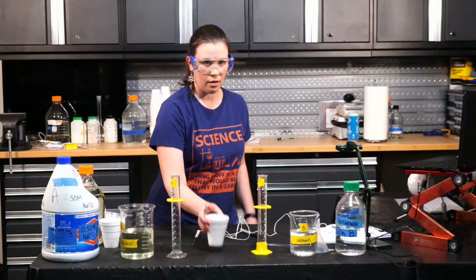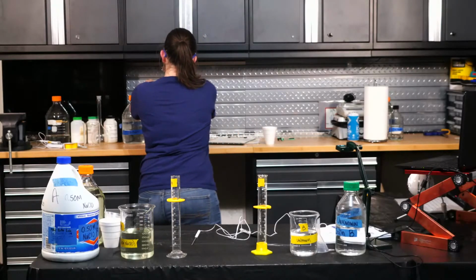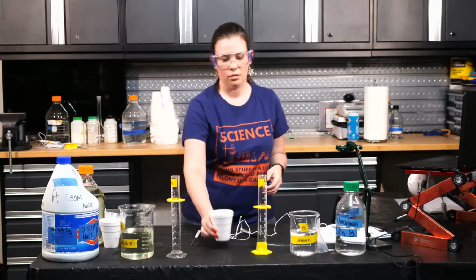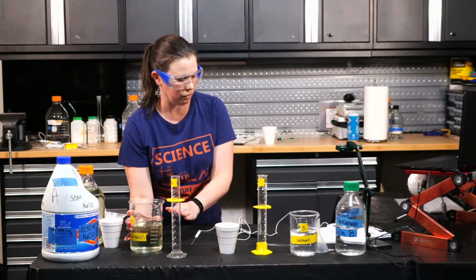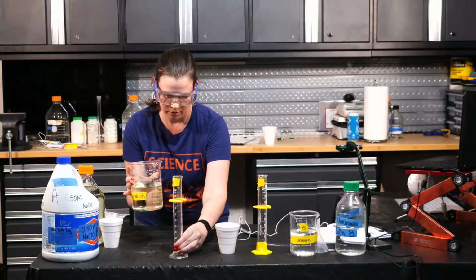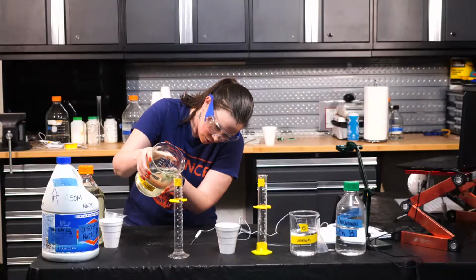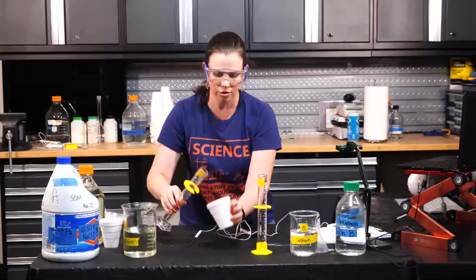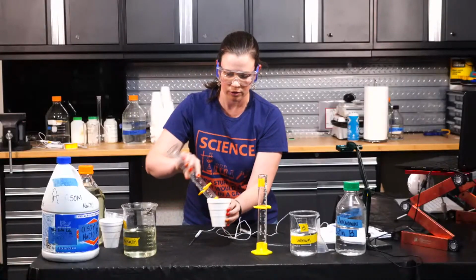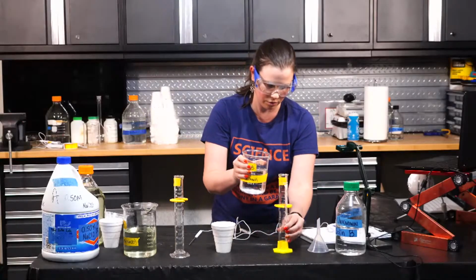Level 2. I'm going to switch this out for a different cup now, and I'm going to mix level 3. Now level 3 is going to be 25 milliliters of each of them, actually. So there's my 25 milliliters of bleach, and I'm going to mix in 25 milliliters of the unknown solution.